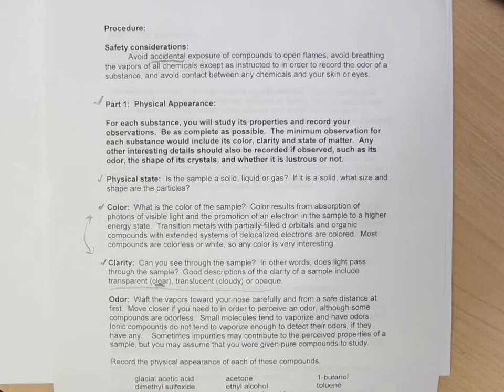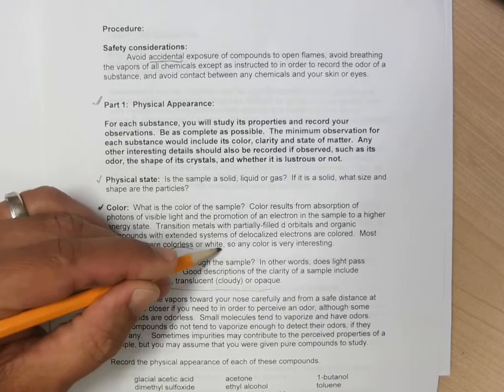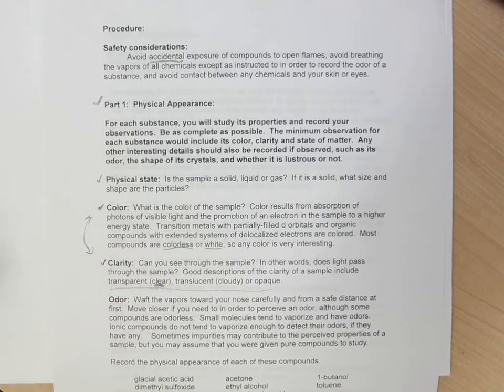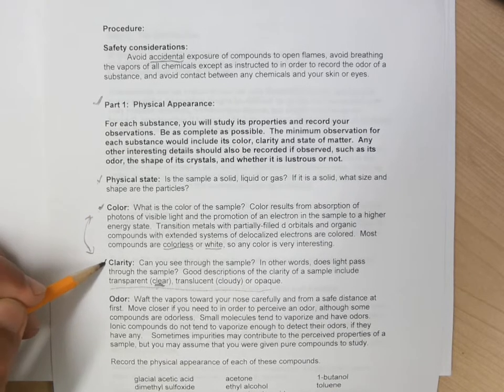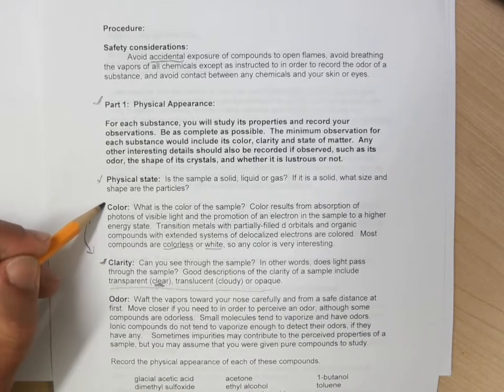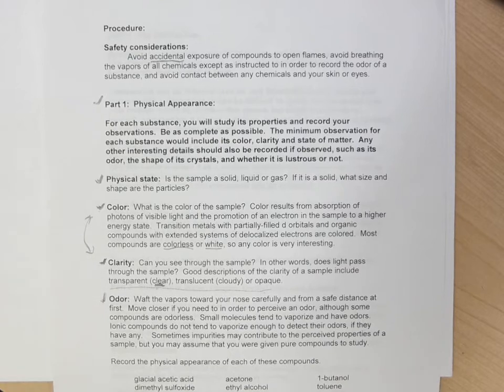If you're talking about color, you have colorless if there's no color, white, blue, red, green, most of us are familiar with color. So the physical appearance, physical state, color, and clarity are very important and should be your minimum observations. If there's anything else, like if you perceive an odor, or if their crystals have a cubic shape or a hexagonal shape, you know, the grain size of the powders could be very important.